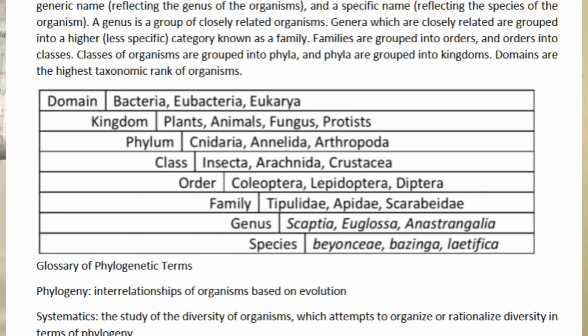Laboratory 4B focuses on the systematic identification of arthropods. The step-by-step process begins with detailed observation of key distinguishing characteristics like body segmentation and mouth parts to accurately place the specimens into the correct order and family. This information is then used to construct its position on the taxonomy tree, moving precisely down to the genus and species. Now, an incorrect classification can lead to a critical failure in controlling vectors.